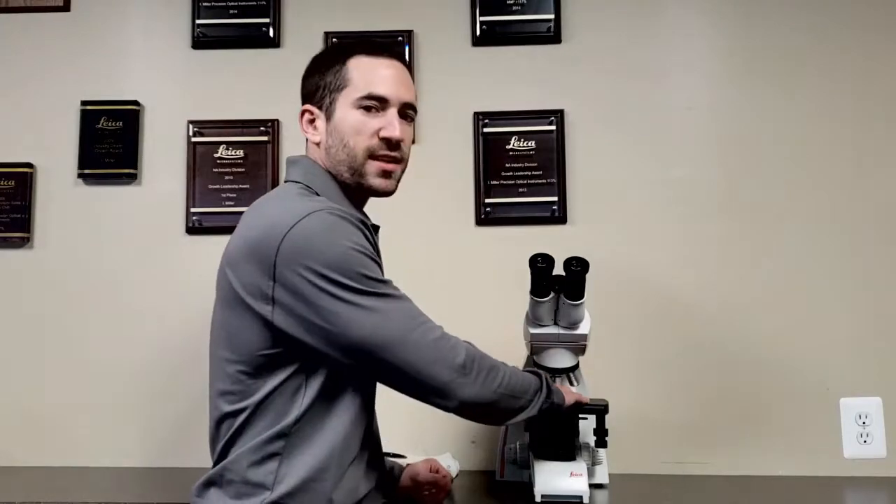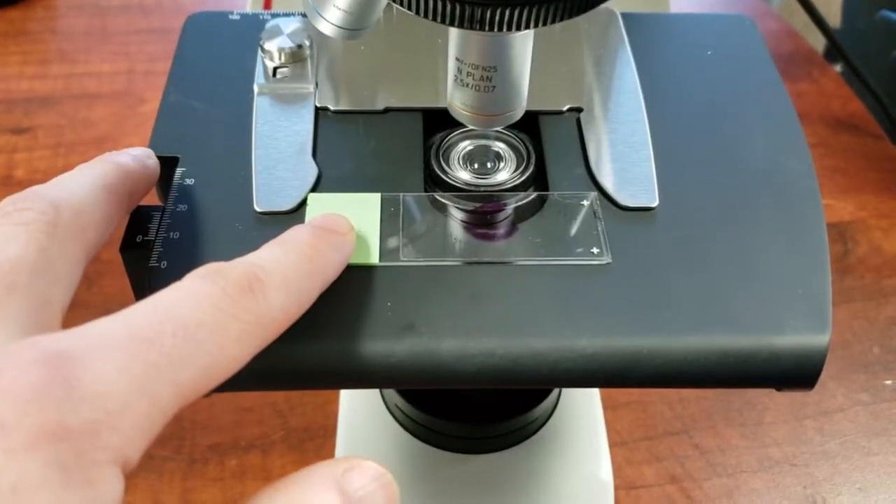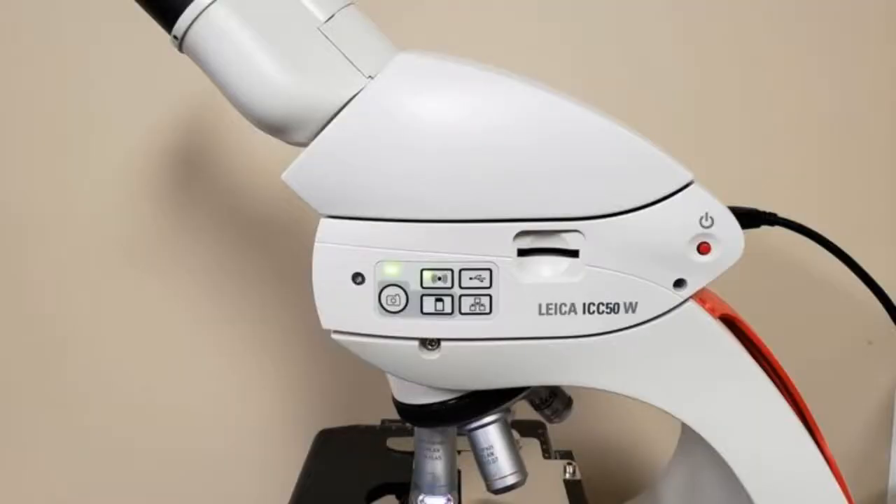Six, the microscope has an easy one-handed slide loading device. Seven, you can add a camera at any time. The Leica ICC50W fits between the head and body of the microscope and outputs USB, HDMI, and Wi-Fi.